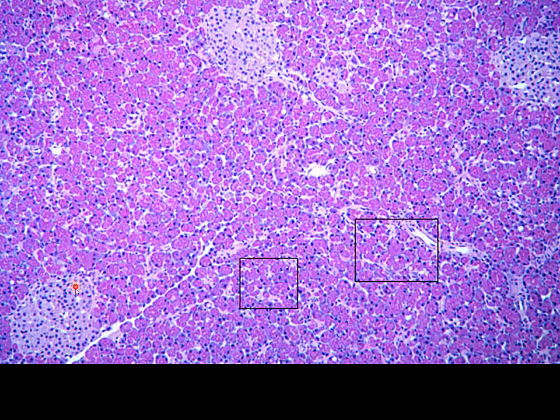So with this view, if we had the accompanying inset to make it even easier, we're going to be seeing the islet cells and our pancreatic cells.